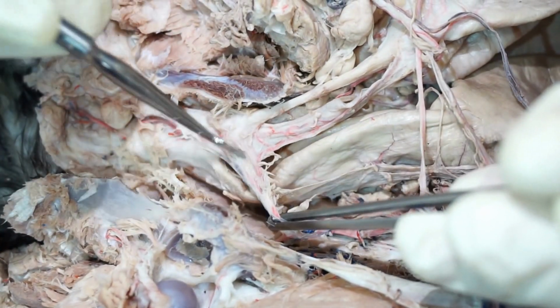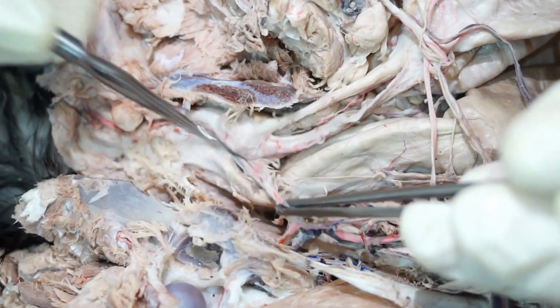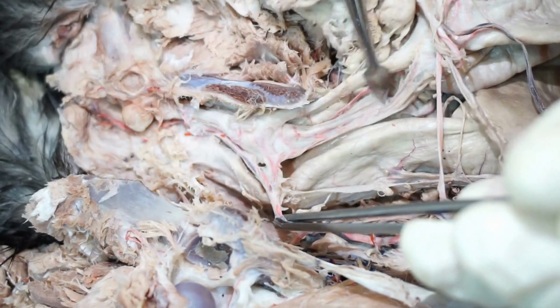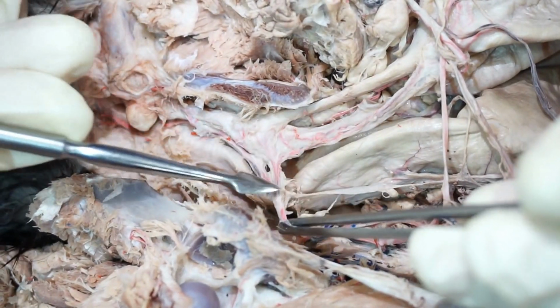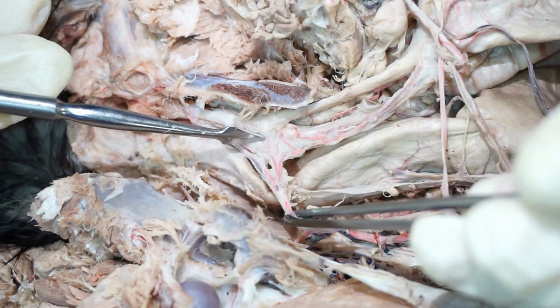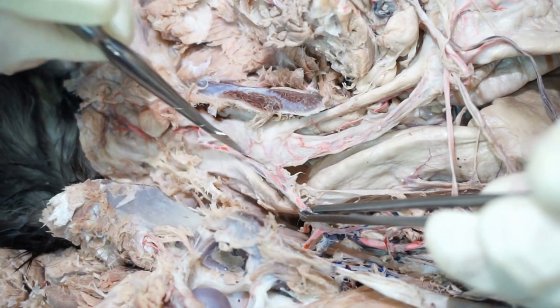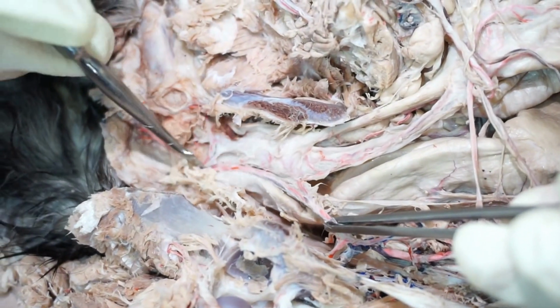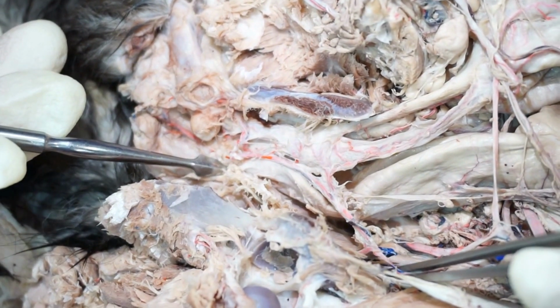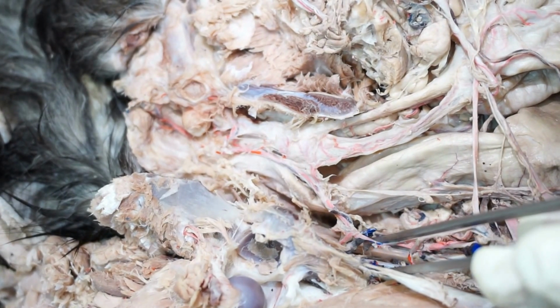That internal pudendal is going to come back and then give rise to either a vaginal or prostatic, in this case a prostatic, and then the pudendal continues caudally.